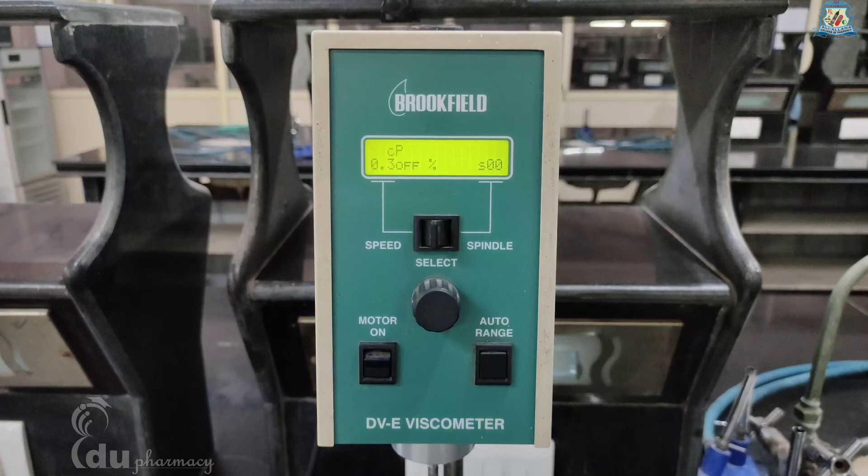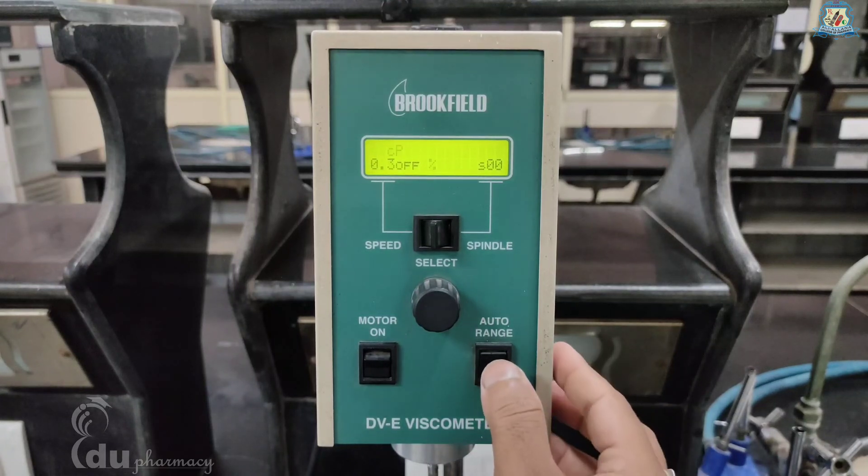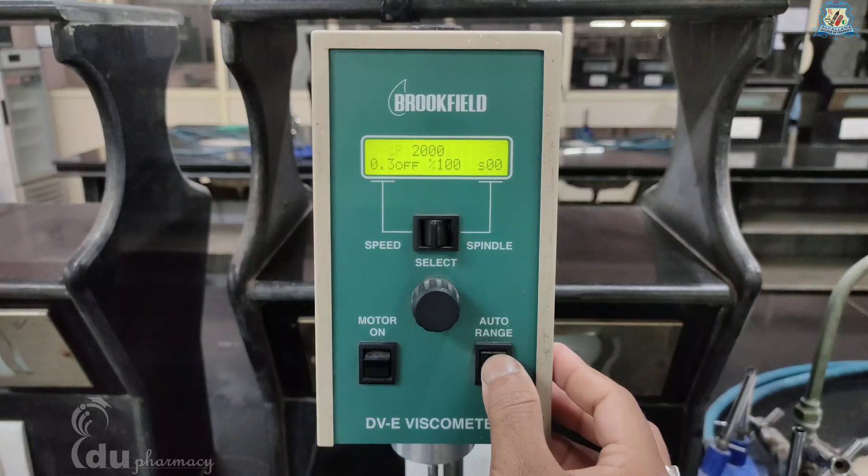The auto range key allows you to determine the maximum calculated viscosity possible with the current spindle and speed setting. Pressing the key at any time will cause the current viscosity display to change and show that maximum viscosity. The screen torque will display 100 percent; this maximum viscosity and 100 percent value will be displayed as long as the auto range key is depressed.